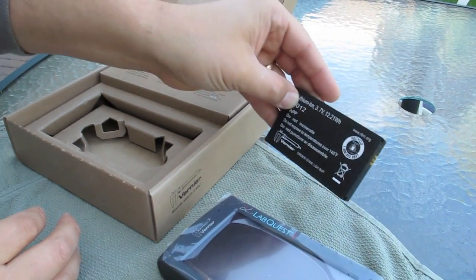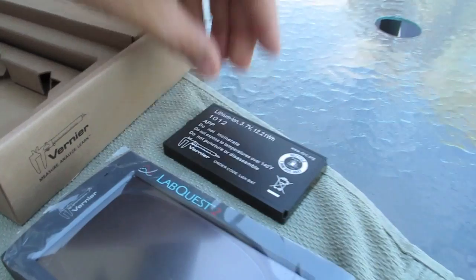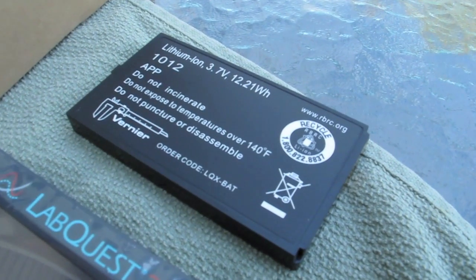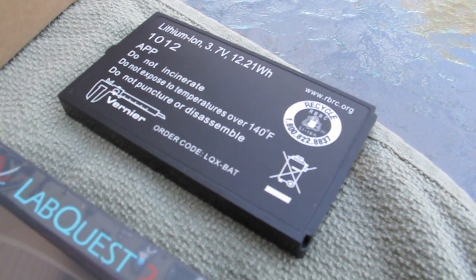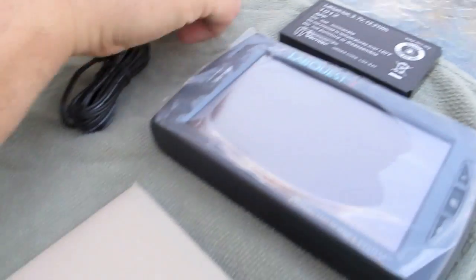We got the battery — that's a nice, giant lithium-ion battery. Big, huge one. Vernier actually sells an additional battery you can use as an extra backup. Make sure you recycle that, boys and girls.